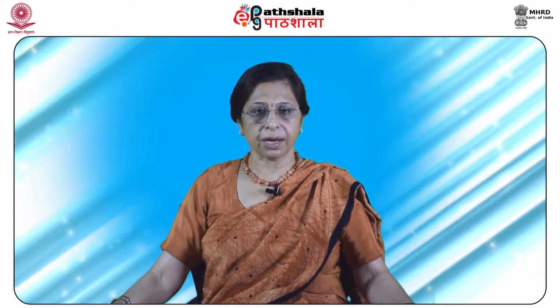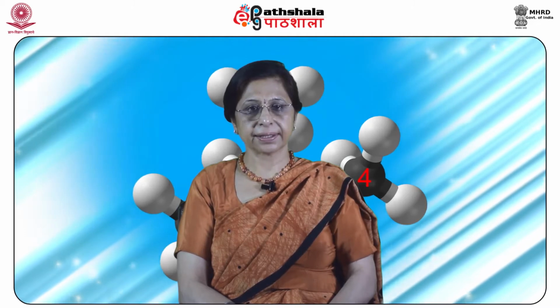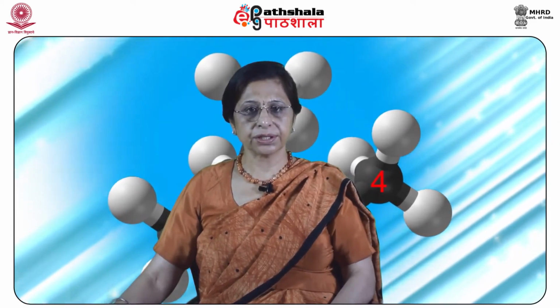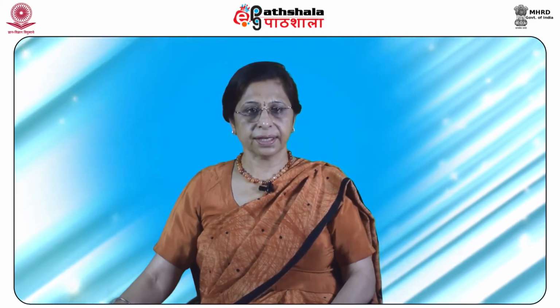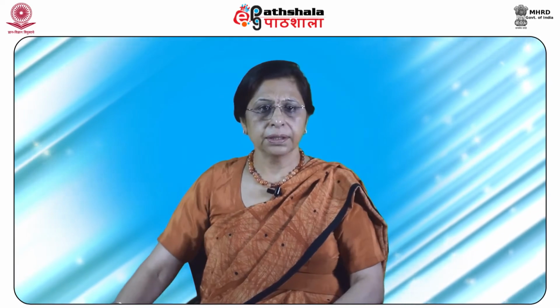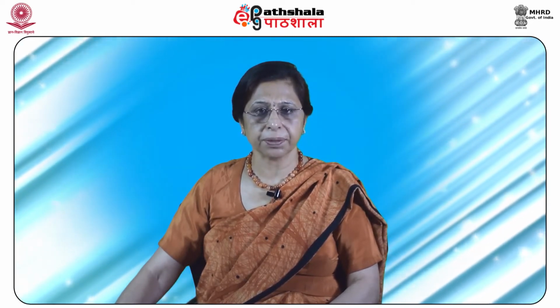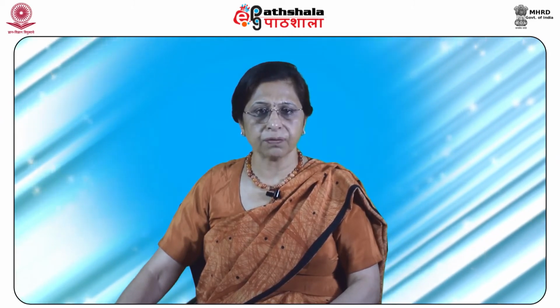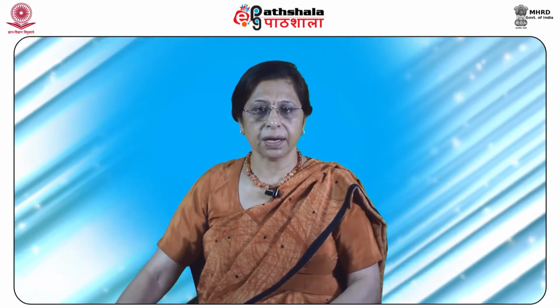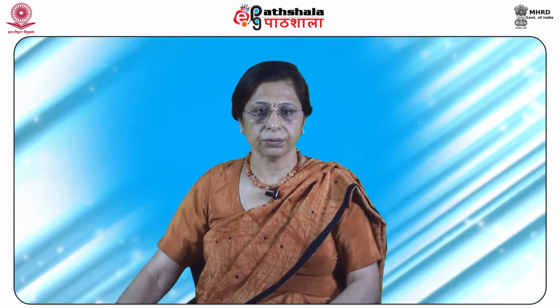The different chromophores are described below. The different chromophores are alkanes. Alkanes consist of only single bonds and do not contain bonds with unsaturation or unshared pair of electrons. Thus, in this case, the only transitions which are possible are sigma to sigma star. These two energy levels have a large energy difference, due to which this transition takes place at high energy due to absorption of ultraviolet radiation of very short wavelength. Due to this, these transitions are of less importance and generally take place at wavelength below 200 nanometer.